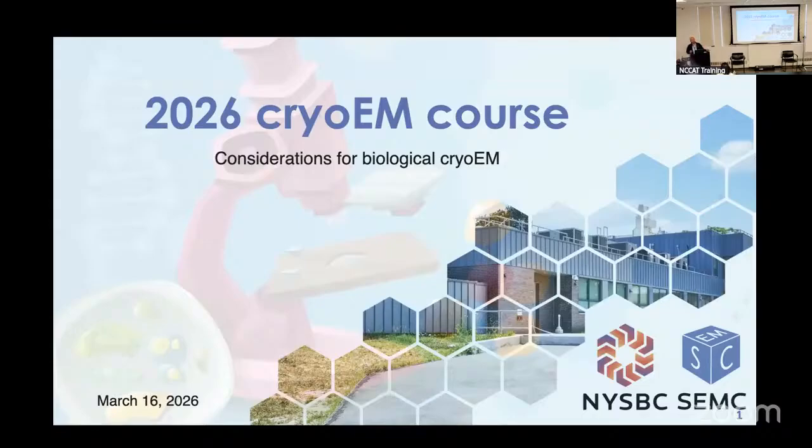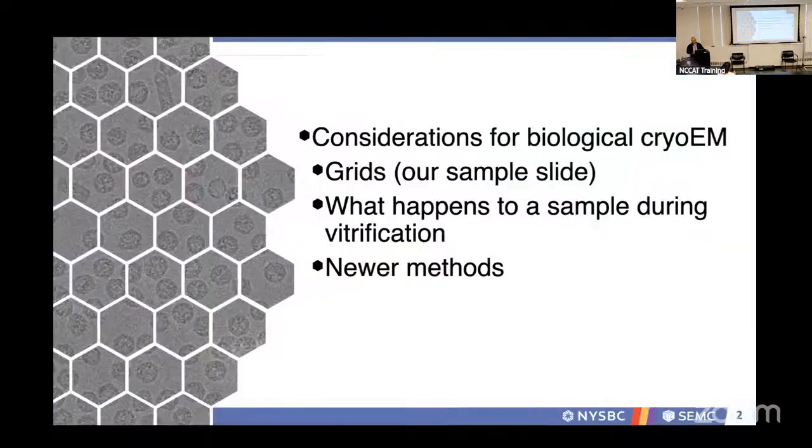So what we're going to be doing this afternoon is we're going to start focusing on sample preparation. And I'll just give you a little bit of a primer on considerations for biological samples with a lens more on single particle analysis. And that's what we're going to be doing. We'll talk about grids. That is our sample slide, as it were, and I'll get into a few more analogies.